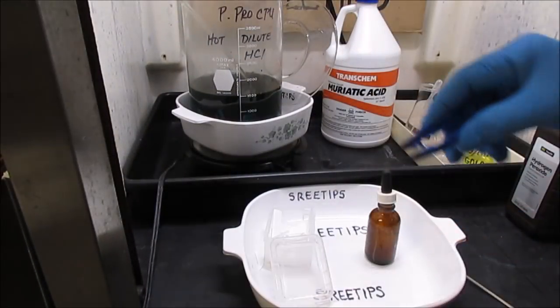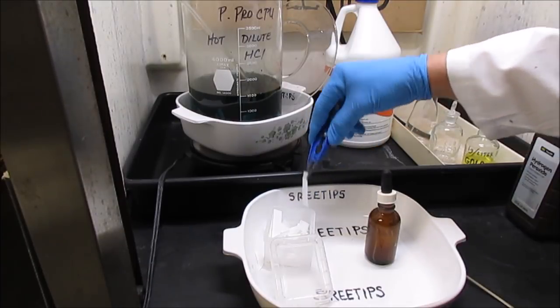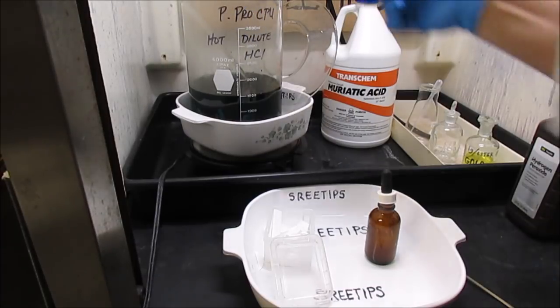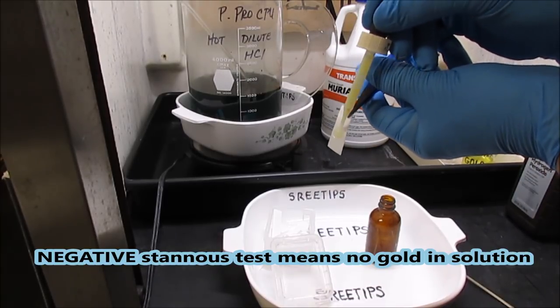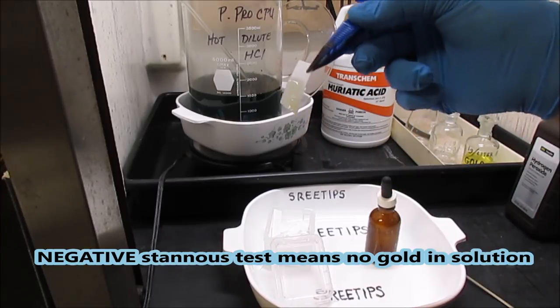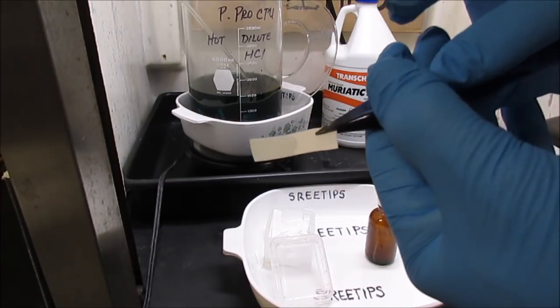The solution's been on the heat now for 24 hours. I'm going to reach in here with a piece of filter paper, get a little bit of the solution on here. I'm going to put some stannous chloride on just to make sure we're not putting any gold in solution here. And as you can see by that, the test is negative. We've got no gold going into solution.